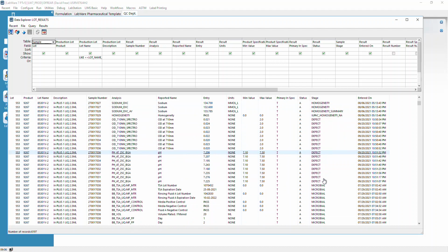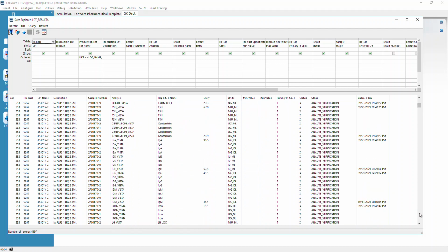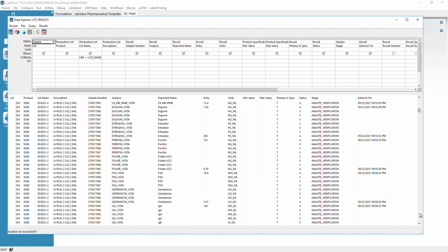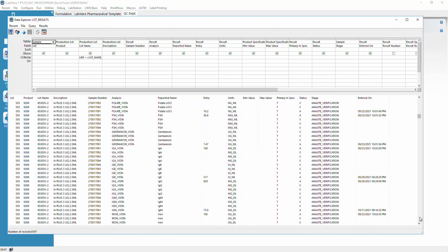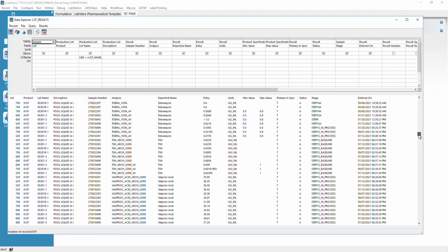Here's the stage, and again, stages are going to be maybe a little cryptic because they are going to show the stage file name or record name. I'm trying to find something that's like a MP. Here we go. So it may be a little cryptic where step 13s run together and then underscore baseline and stuff like that, but you'll get the idea.